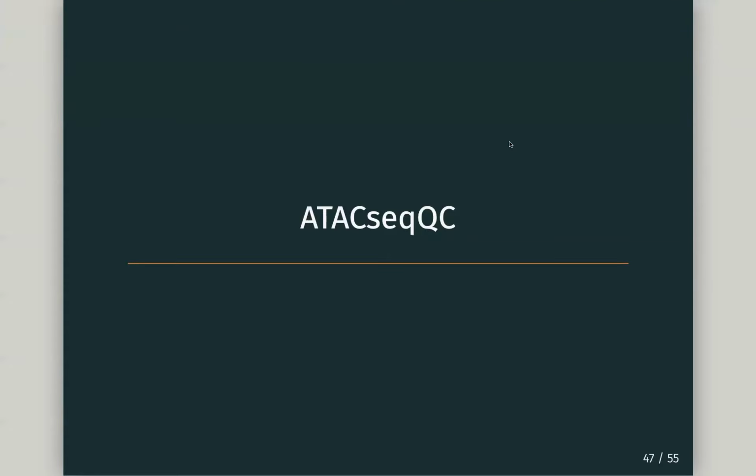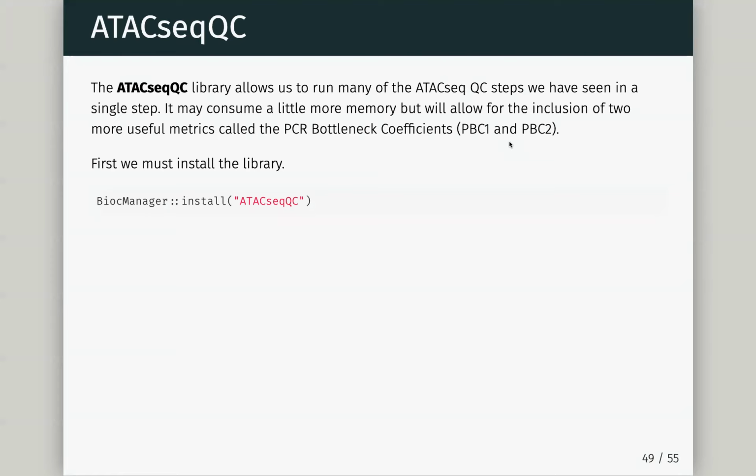So I think the final thing we're going to cover today, just enough time, is 2 more metrics. So ATACseqQC, it's written by a friend of ours, Zhu, we like her a lot. It's not the most memory efficient tool in the world, and that's just because ATACseq is hard to deal with. You have to hold a lot of data in memory to do this. She's very responsive if you write to her directly. But I warn you, it will take up a lot of memory, and you may never get to finish it on your laptop. It's just doing a lot.